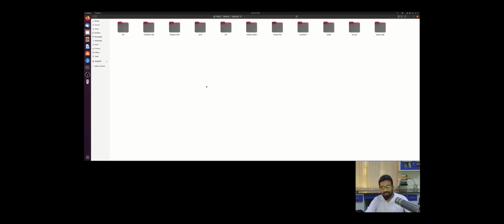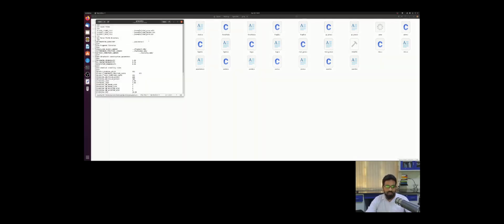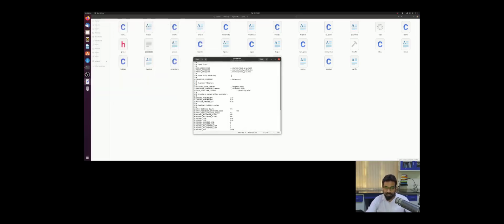Once we run pocket successfully, we have 2 options. Either we can go for grow or we can go for link. First we'll finish the grow. So we go to the grow folder and open the grow.index file, because this is the file we are going to edit for running the grow program. I'm opening this file using a text editor. Now we have to change this. For the first step I already made the changes.